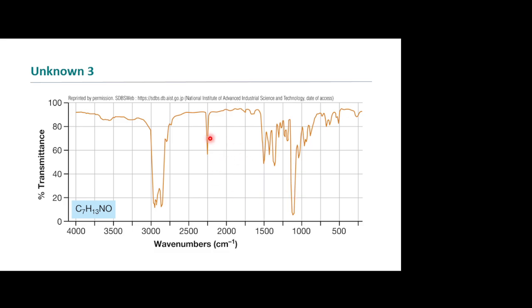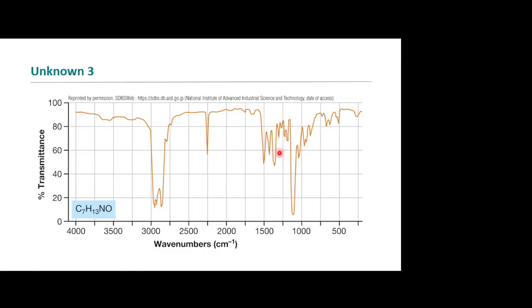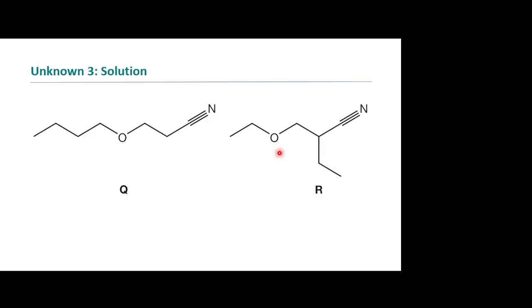But we don't really need that because we already have all the evidence we need up here, so we don't have to go to the lower spot. But if you wanted to differentiate between these, we could go further. I don't know if we'd be able to get all the way, because I haven't done a full spectrum of this and assigned all the bands. But we could definitely differentiate between the symmetries, and if these had branching near it. So we could do some more work.